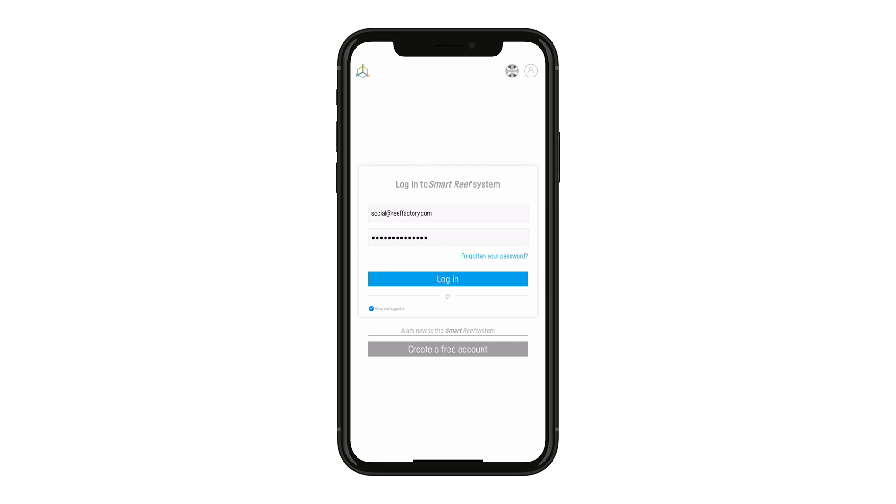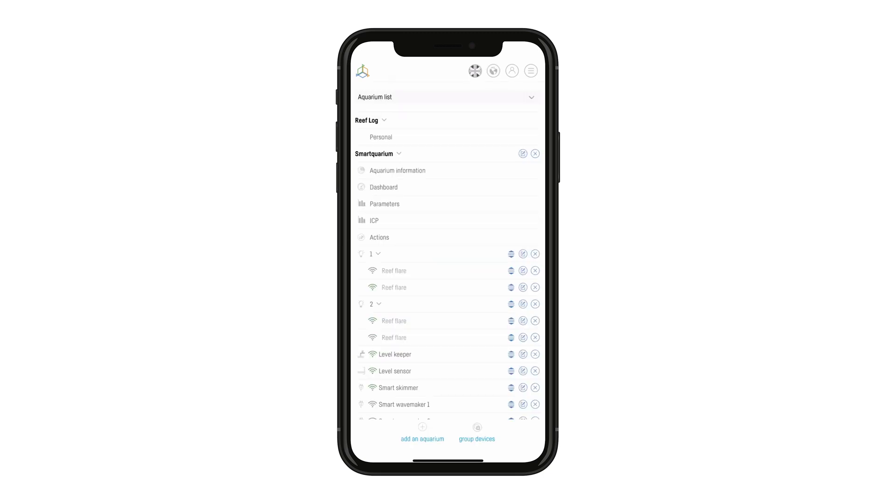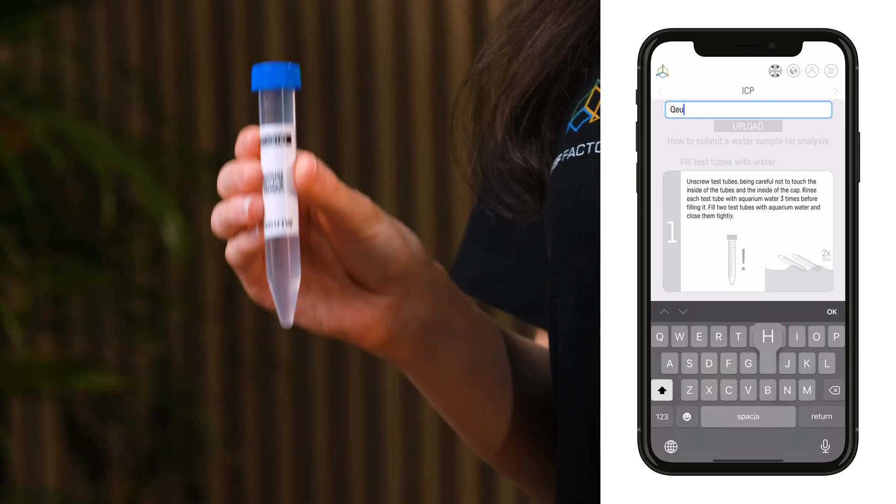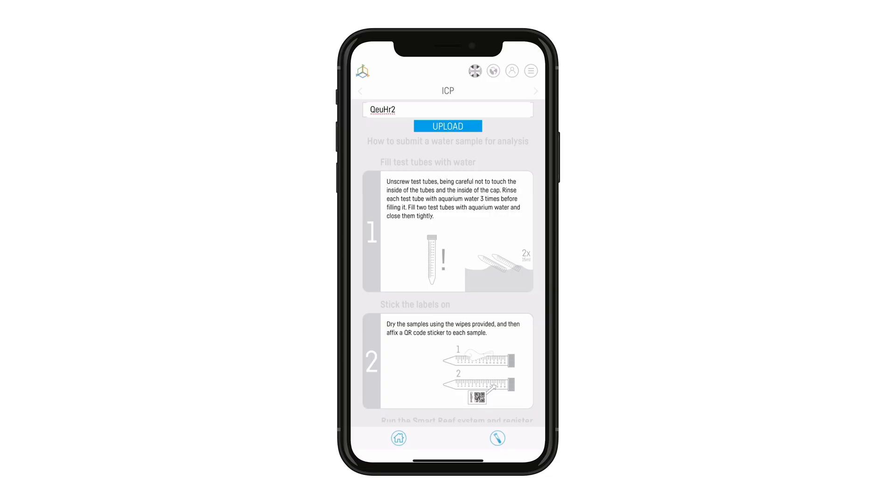Now open the SMART Reef app or go to reeffactory.com and log in. If you haven't got the app, download it, register, and create your aquarium. In the ICP section of your aquarium, enter the string of characters that's under the QR code and press submit. Bravo! Your sample has been registered.